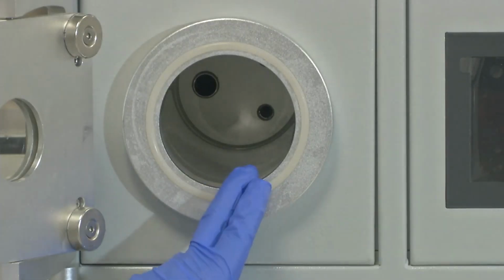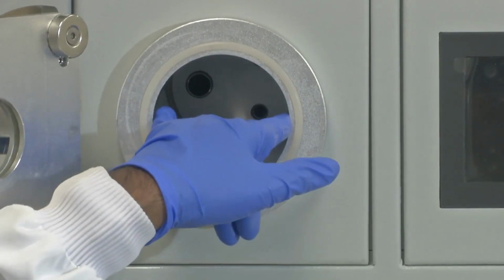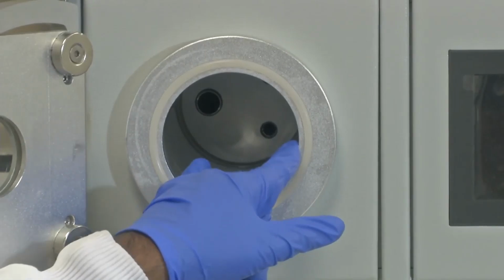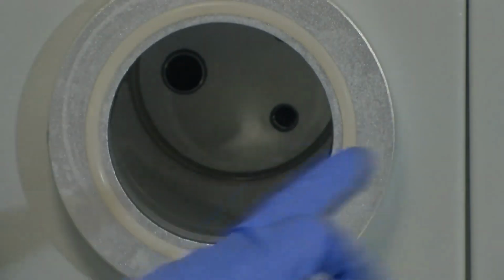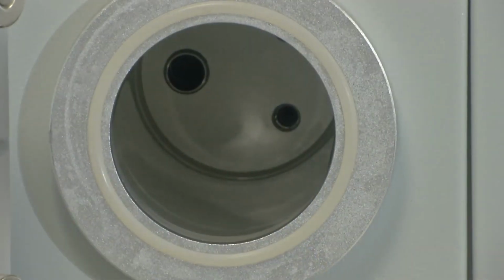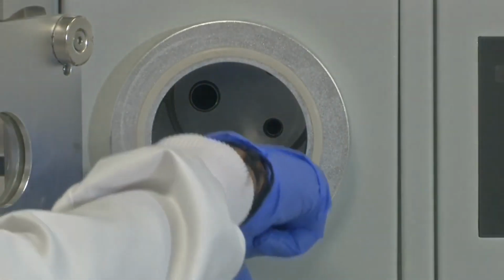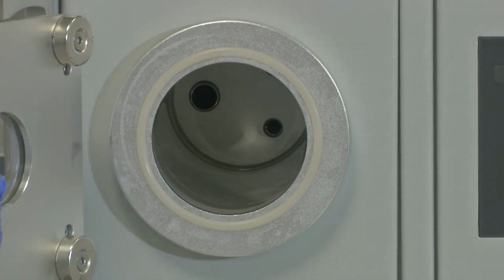So now we have zoomed into the chamber. You can see it is a 2-liter volume chamber. The diameter of this is around 3 inches, 4 inches actually, almost 3.8 inches, and then the volume is around 2 liters inside. Now if you look closely, you can see a coil that is running around it. That is the RF coil. We transfer RF energy to the oxygen through this coil. That is the RF coil which creates the plasma, and if you look at the end of it, you can see some holes. Those are the holes through which air is sucked out.